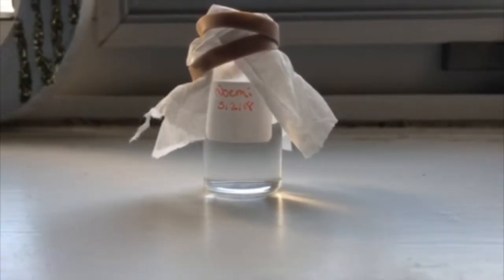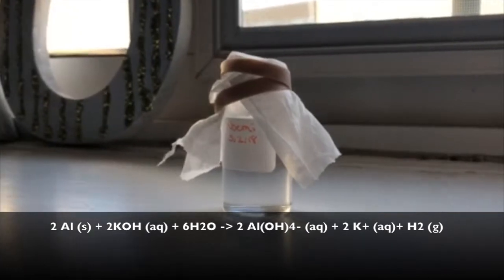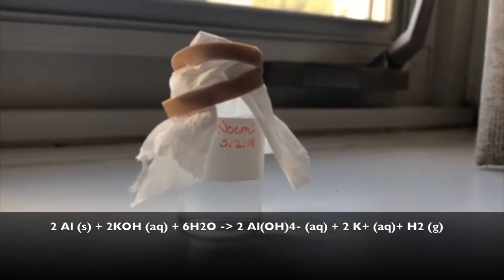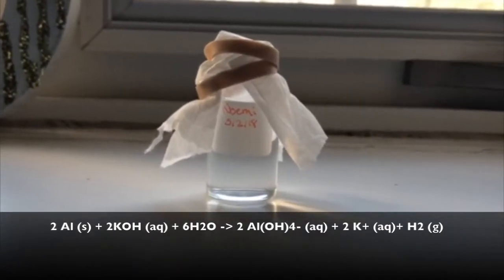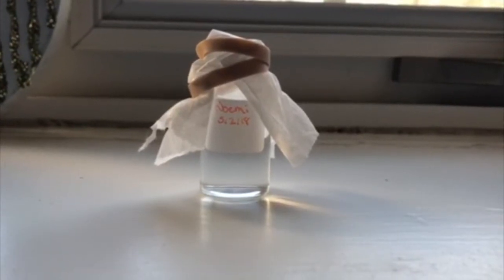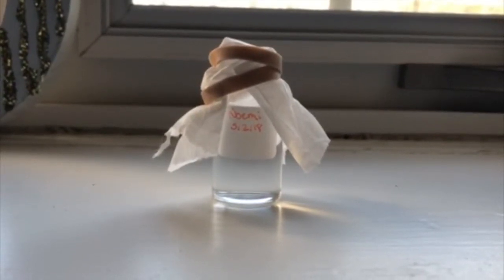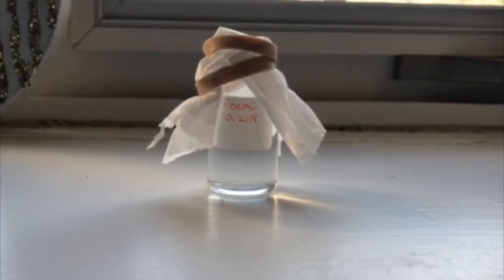This reaction is represented by the following chemical equation. As we can see, the solid aluminum foil combined with the hydroxide from the KOH to create aqueous Al(OH)4-. The potassium from the KOH remained as aqueous K+ ions in the solution, and we can also see that hydrogen gas was produced. Next, we filtered the solution in order to separate any insoluble solid impurities that remained in the aluminum solution using a vacuum filtration method before moving on to reaction 2.